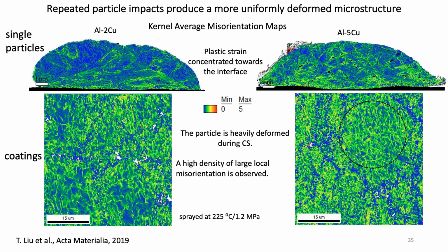Okay, the last thing I want to say before we change topics is that this is, of course, the single particle impacts at the top that we've been talking about. We saw that there was more plastic deformation closer to the interface, but it is clearly heterogeneous.